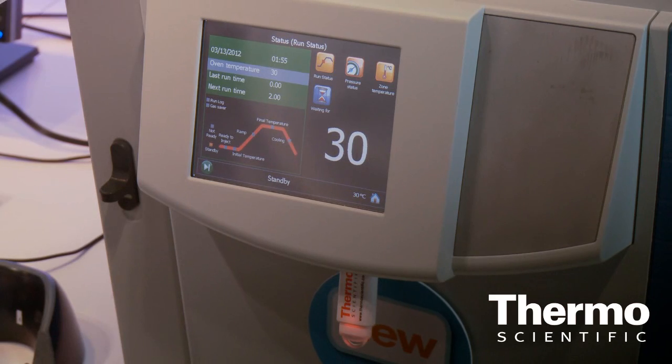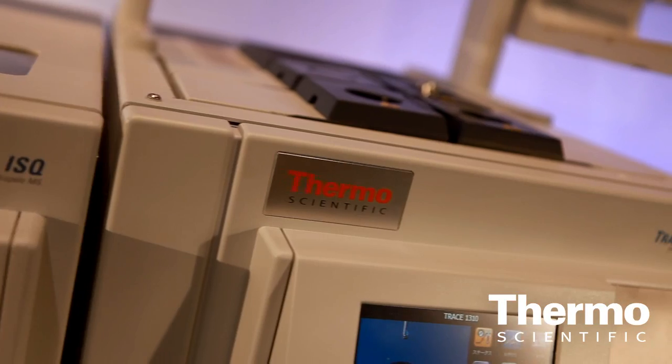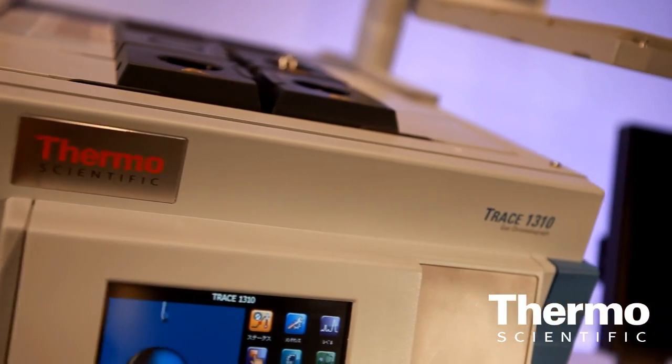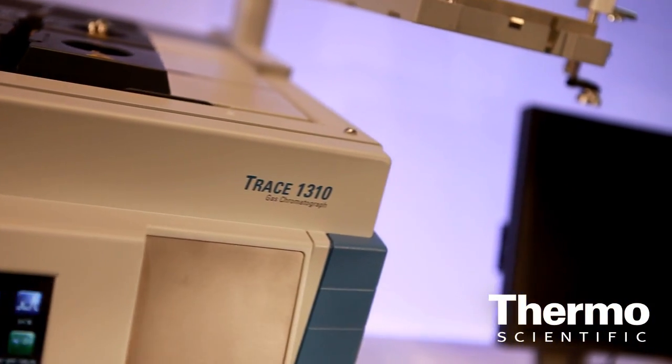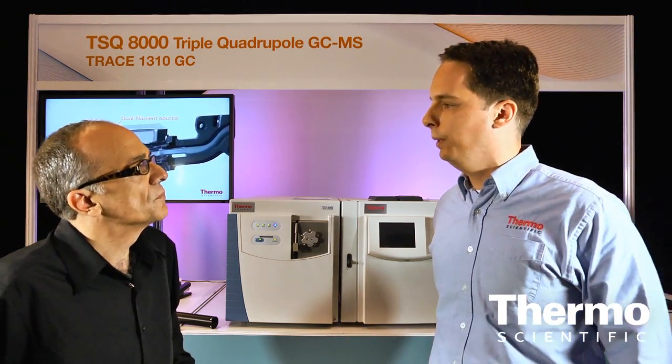It also features the ability to remove injectors and detectors very simply by removing three screws. We have this modular concept on the GC that allows users to add additional features any time they want — adding an additional injector and an additional detector to basically expand the possibilities of the instrument.